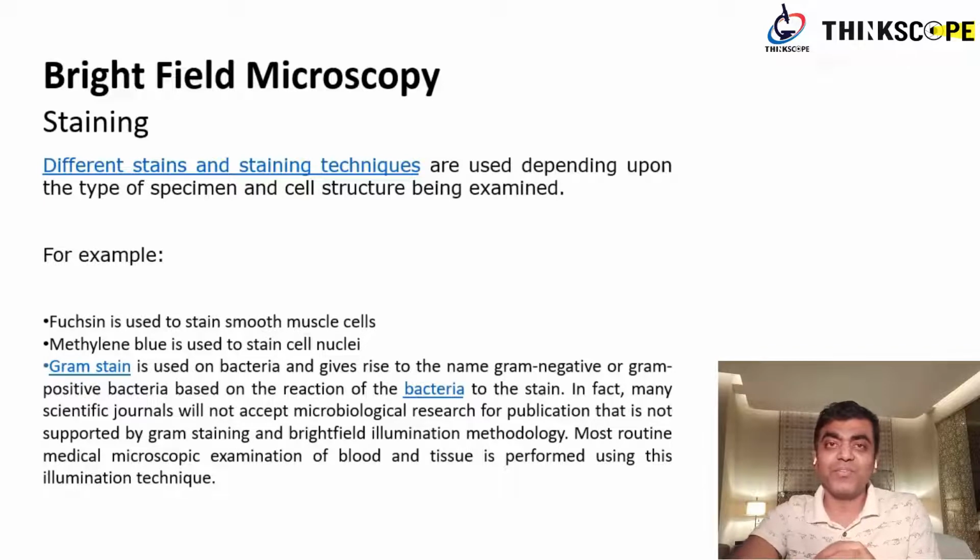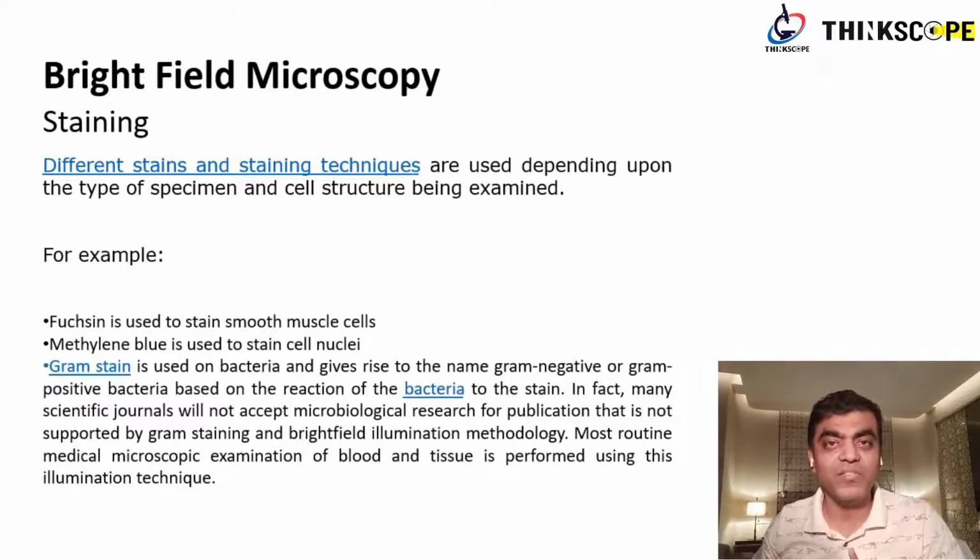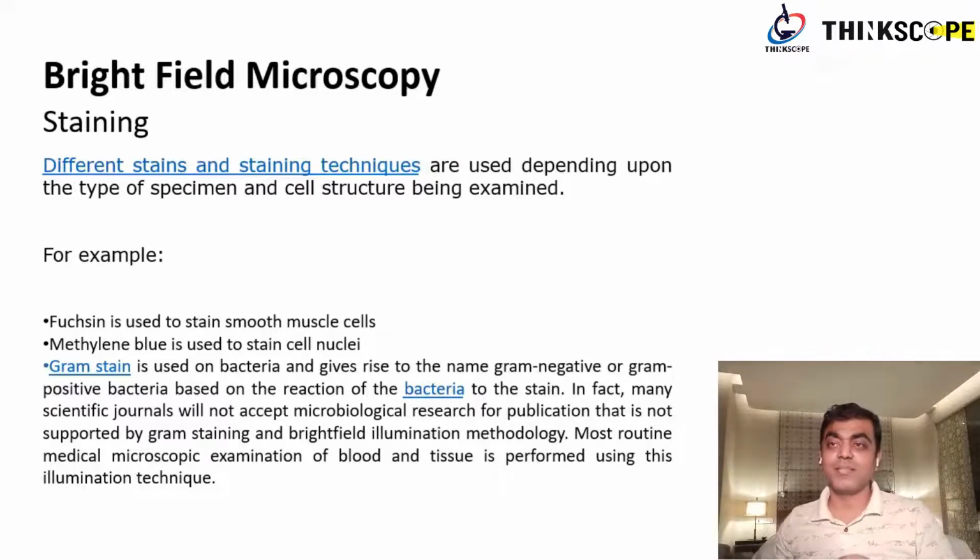Okay, so there are a lot of stains, like acridine orange. These different stains are very commonly available, and what you can do is put them in your sample, and the colors go and fix onto the architecture required. They will not bind everywhere, but go to specific targets, and then you wash it off. After you wash it off, your background becomes clear. The stains have already touched those areas where they are meant to be.